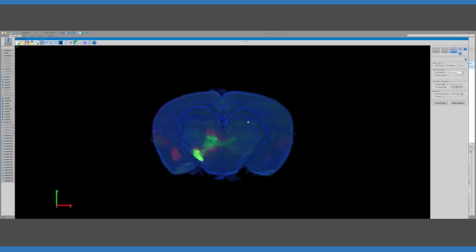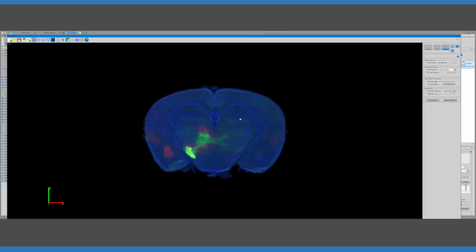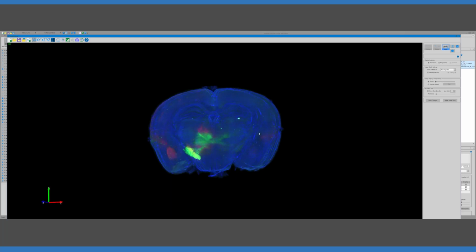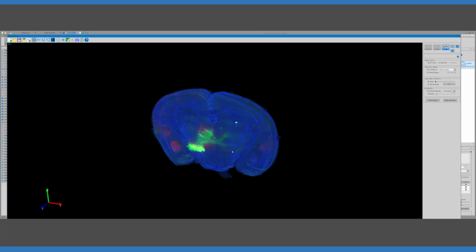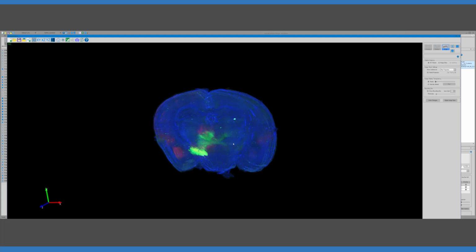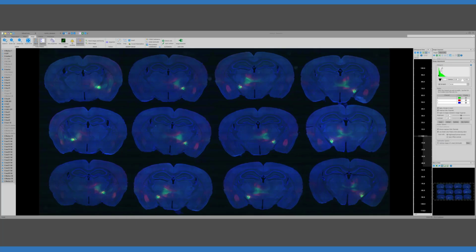And so this is the output, viewed in 3D. Again, for those 7 sections. This is just a slab of 13 sections of that whole volume. 13 sections, sorry. Yep. But now I want to show one other important thing that we do. We just close this.